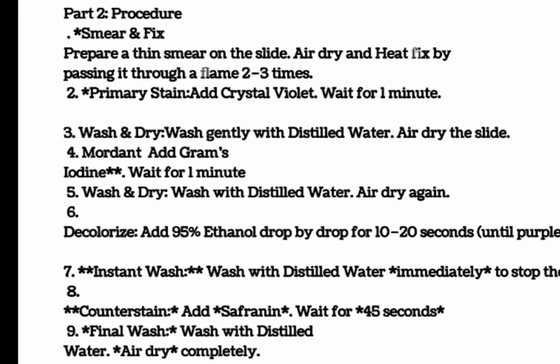Air dry. 8. Counterstain. Add safranin. Wait for 45 seconds. 9. Final wash. Wash with distilled water. Air dry completely.